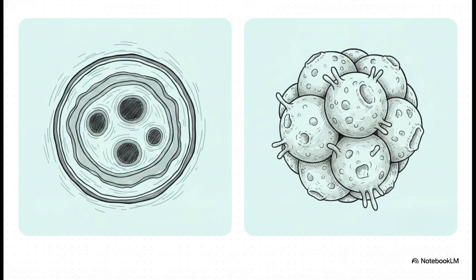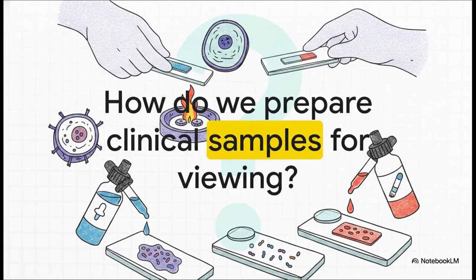So, the crucial point here is the visual result. Because TEM cuts through the sample, it yields extremely detailed, 2-dimensional internal cross-sections. You get to actually see inside the cell. Dense viral cores appear dark, open cytoplasm appears bright. SEM, on the other hand, bounces off the outside. It produces incredibly realistic, highly resolved 3-dimensional surface topography maps. Basically, TEM lets us look inside the factory, SEM lets us map the outer walls, the cilia, and the external viral budding.